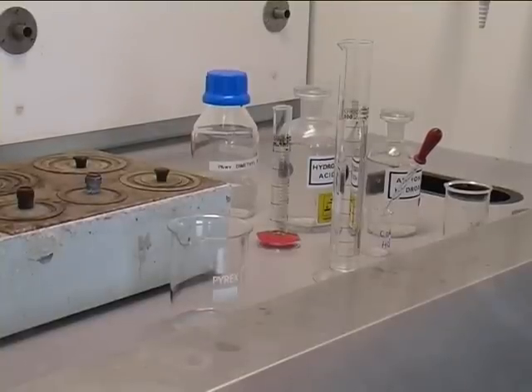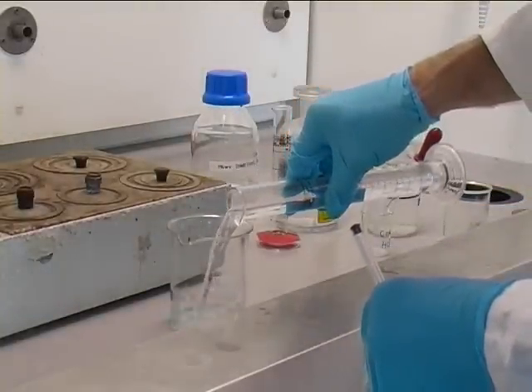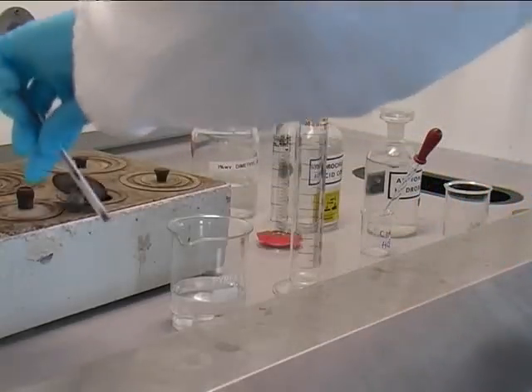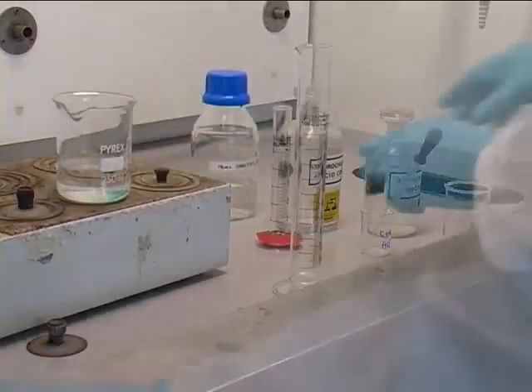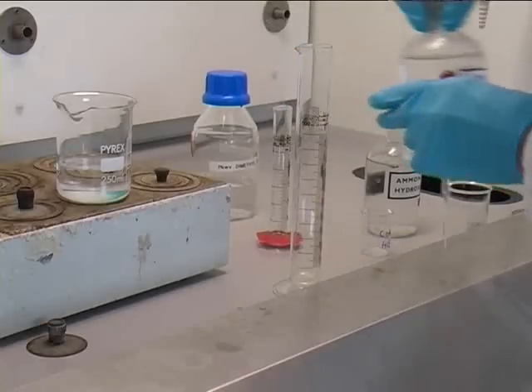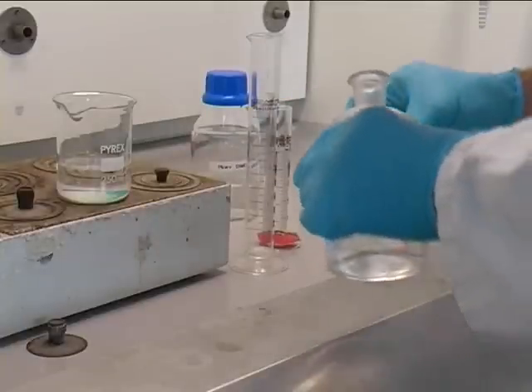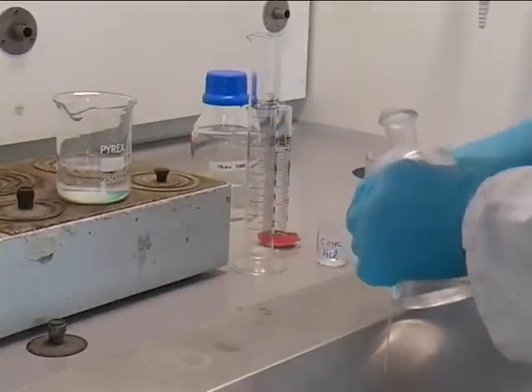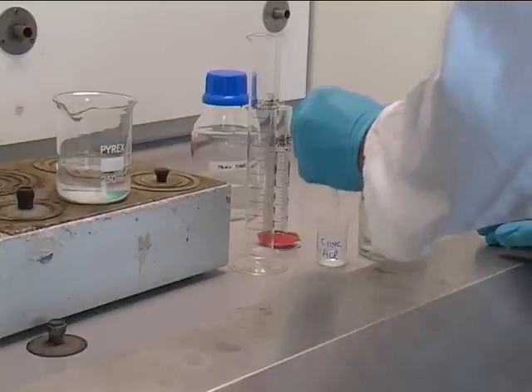Add water to your nickel sample and place on a steam bath. Decant concentrated acid into a small beaker and add to your solution.